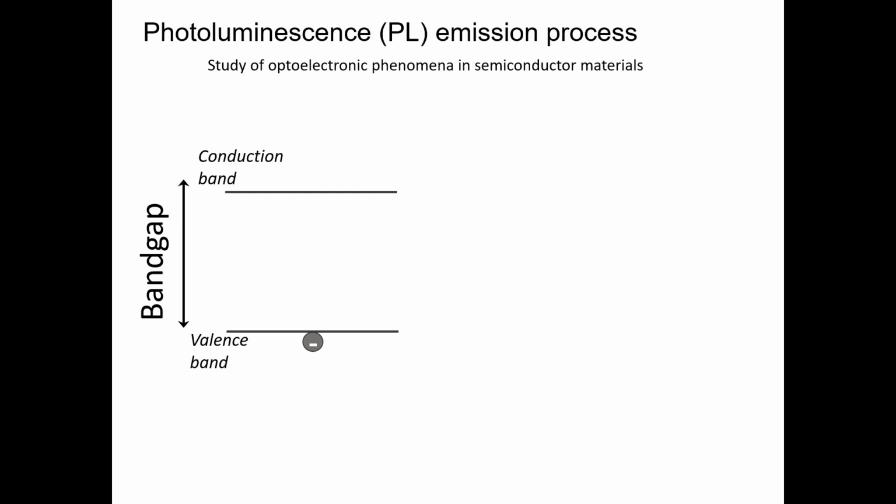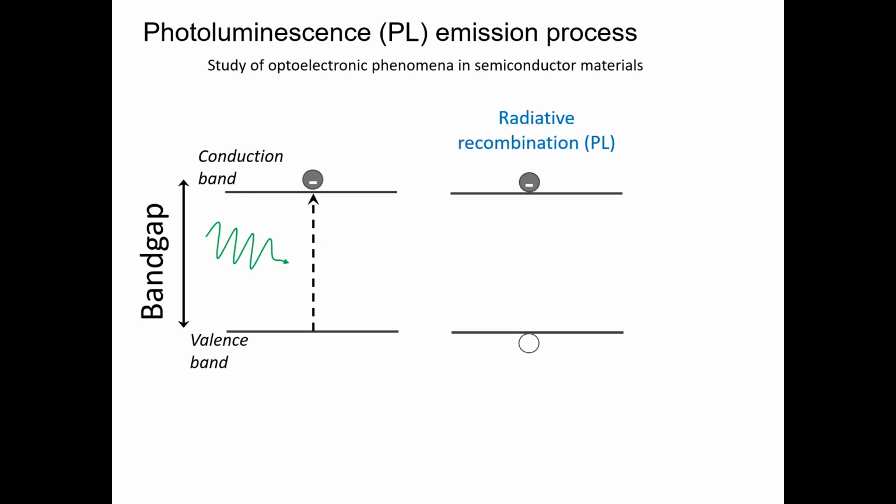Photoluminescence, very briefly, is what happens when you shine light on a solar cell material. That light gets absorbed, and it also excites electrons, which is what's going to be producing the current. However, instead of generating a current and letting that go into electricity, we just let that electron relax back down. And that's what's called photoluminescence. When it relaxes back down, it releases light, and that's the light that we're capturing here, that photoluminescence. And it will tell us a lot about the performance and how well light is being absorbed.